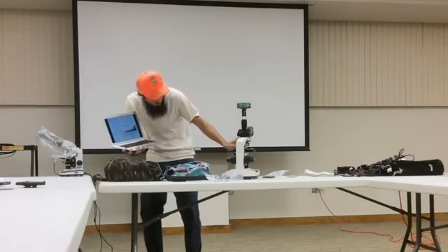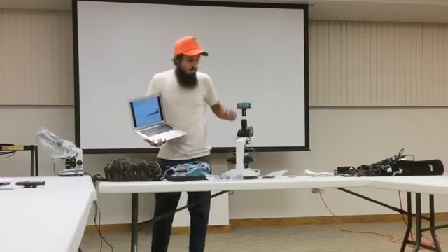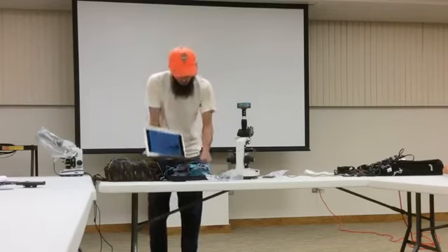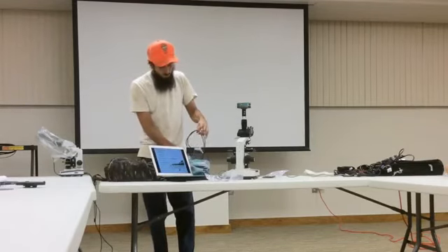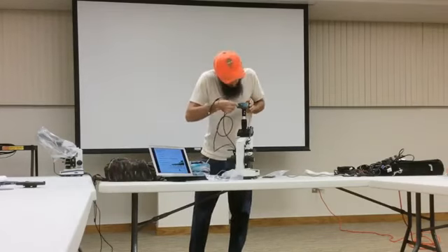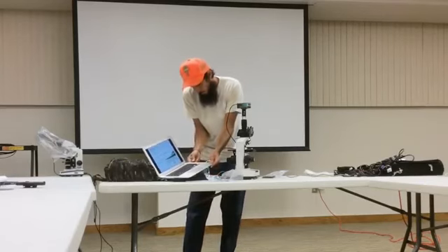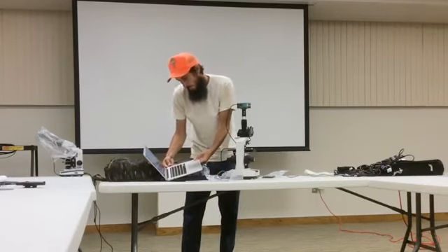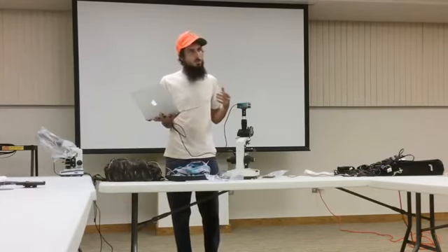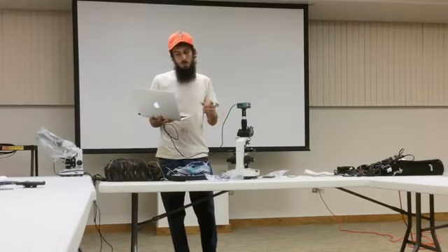So what I do is I put the microscope to 100 times power, and then I just scroll across the slide. Nematodes, once you find the nematode, you can identify what it is. But for every slide, I should have one nematode.